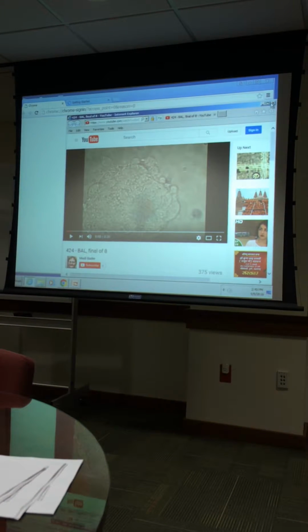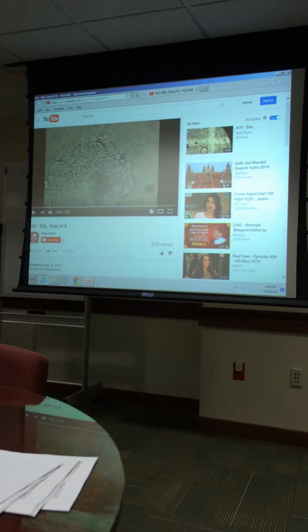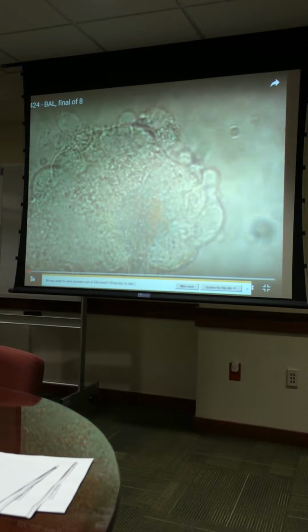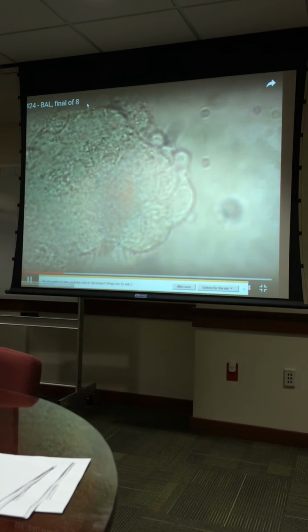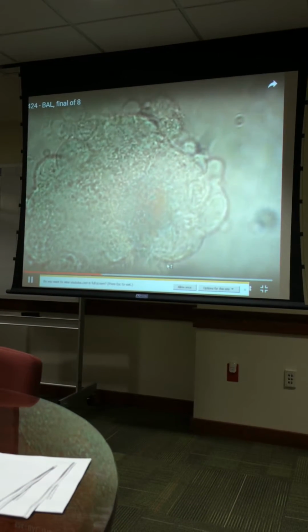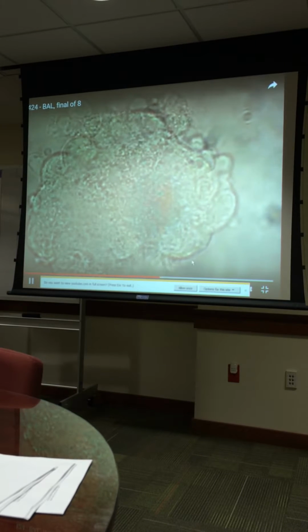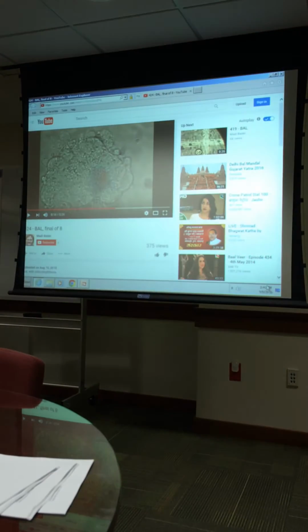Okay, so here's a YouTube video of ciliocytophthoria. Sometimes people mistake them for parasites. This is obviously a wet prep, and it's a video. You can see these are the cilia that are sort of beating back and forth. This is a group of bronchial epithelial cells, and they could be mistaken for a parasite, but they're just those respiratory epithelial cells. Bronchial epithelial cells.